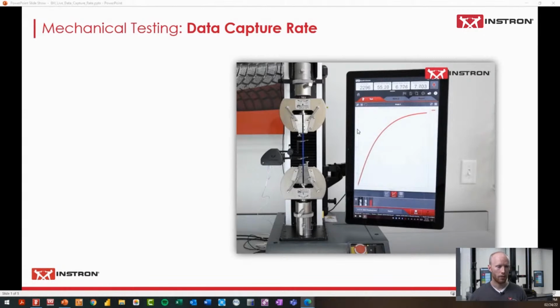On the right is our all-in-one computer, where you can see a snapshot of a test curve. You might have force on the y-axis and displacement or strain on the x-axis, where we're graphing and displaying the data that's being captured by the system.